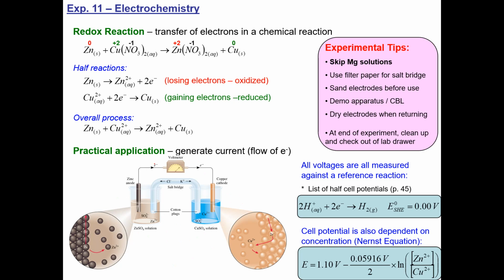It's a device, much like this, that's going to have 2 half reactions separated such that we can put something in the flow of electrons, in that stream of electrons, and power it. So our cell phone battery may look a little bit different, but the basic idea is what we see here. Now, when we think about these batteries that we produced, we're going to be measuring the flow of electrons and indicating the extent of the reaction by measuring a voltage using a voltmeter.